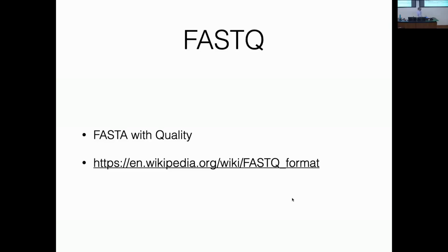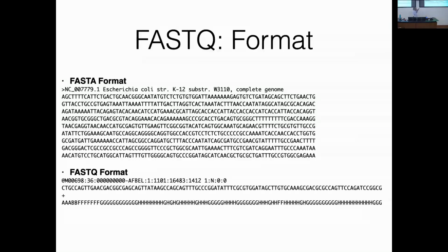Okay, so I already showed you a little bit of a FASTQ file before, but now I'm hoping that some people are familiar with FASTA files, so even if you've never seen a FASTQ file before, the comparison will be helpful. If you've never seen a FASTA file before, it's okay. There are a lot of similarities between them. Both of them have at least one header, and both of them contain at least one sequence.